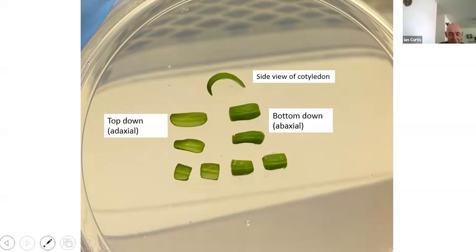Okay. One final question: in your rooting media, you don't use an auxin, is that correct? Is that because rooting in tomato is fairly straightforward? Yes, it's very straightforward. It roots readily in medium without growth regulators. However, there have been times, with gene overexpression or gene editing, when we had difficulties getting shoots to root.